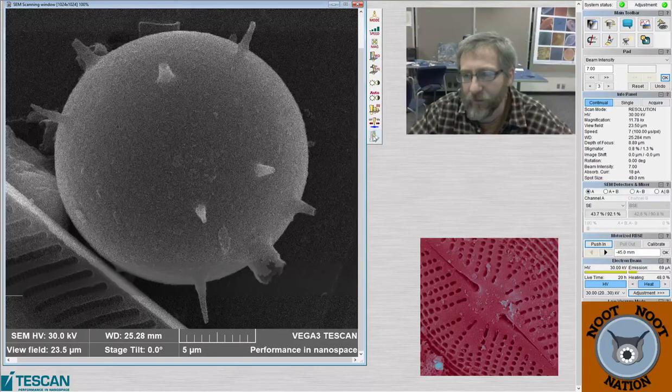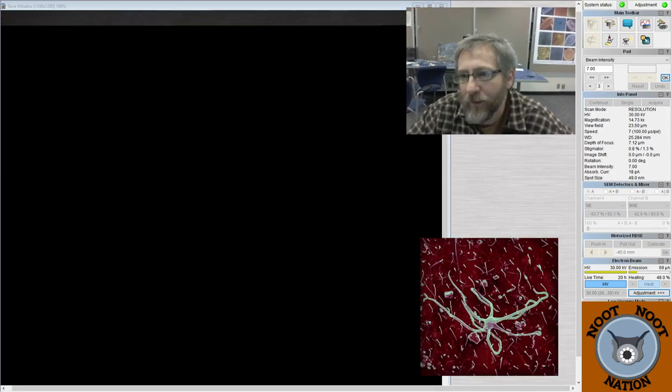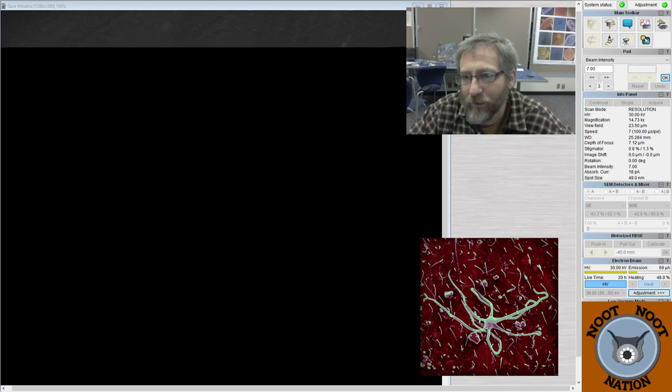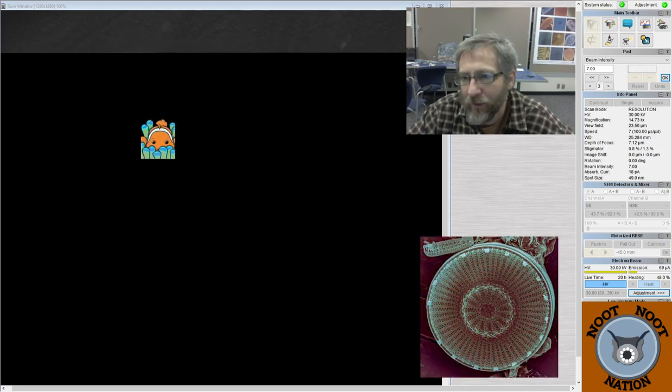So I'm going to grab this picture so I can come back and chat a little bit. I was busy blah, blah, blahing and moving around, and I missed all the conversation about what's going on. Yeah, some can be mixotrophic. It's hard to eat anything when you live in a glass castle.